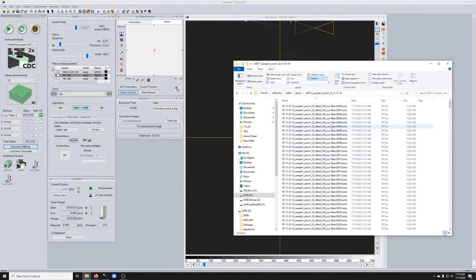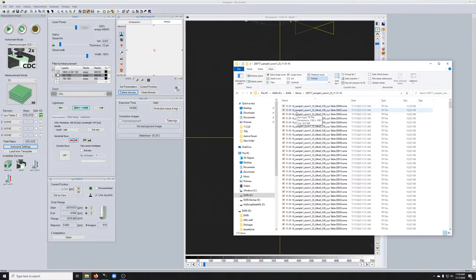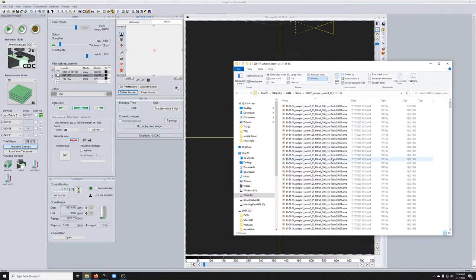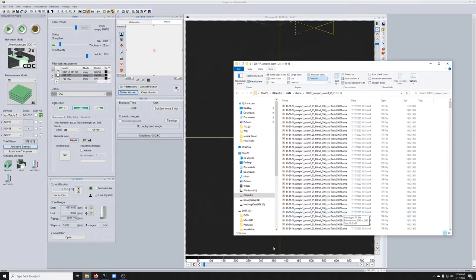You can see that the individual files, the way they are named is they start with the time at which the imaging began. They have the base name. Then they say Ultra2C00. This is if there were multiple channels, that number will change. And then XYZ table Z, 0000, 0001, etc. That denotes the Z dimension of this data set.